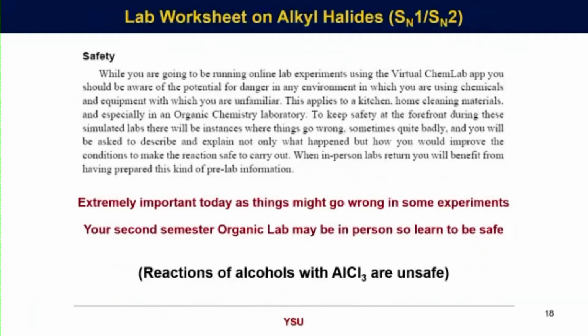So at this stage, we started to recognize that one of the big things about doing stuff online is safety and the lack of appreciation of safety in an organic lab. So we had to build something in here that would go wrong. And boy, can things go wrong if you set it up right.